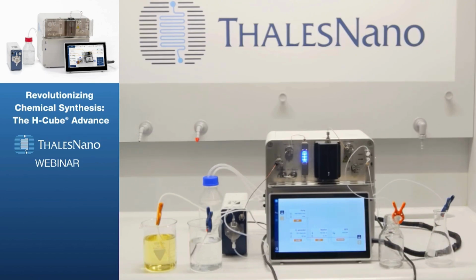And if you're doing a real experiment and you don't know anything about your chemistry and you want to do a small optimization project, which is just a trial of several different other parameters, you would be able to do it now. So it's possible to set up different parameters during the experiment. You don't have to stop the run, but you can change the parameters during the operation as well. Or you also have the option to stop the experiment.